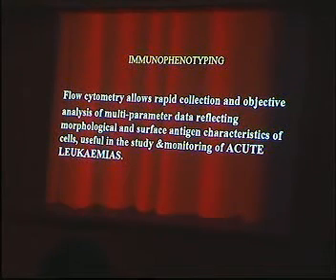Why am I spending time on immunophenotyping? Because we are going to a world where we need evidence. We all, as pathologists and immunologists, know that sometimes on the peripheral smear or marrow, we may or may not come to an answer. In today's world, we want to be more and more careful. We want to do more evidence-based medicine. Immunophenotyping done by flow cytometry allows rapid collection and objective analysis of multi-parameter data, which reflects the morphological and surface antigen structure of leukemic cells. Therefore, it can give us a much better insight into what we are dealing with. In the next 3 or 4 slides, I'm going to show you why immunophenotyping is done only for those patients who want to undergo therapy. If people do not want to undergo therapy, there is no point in spending money on this.